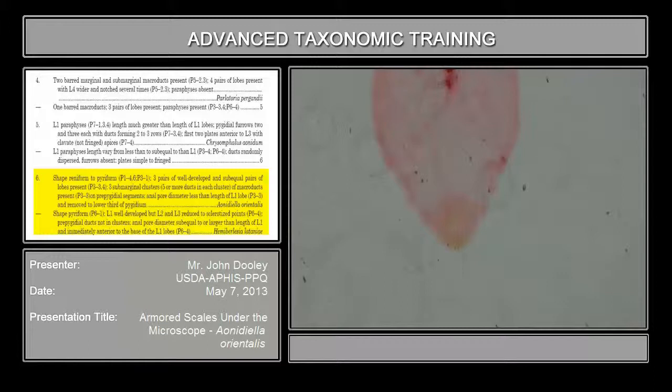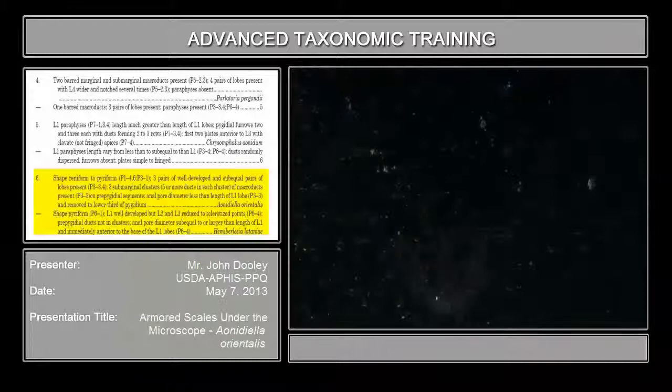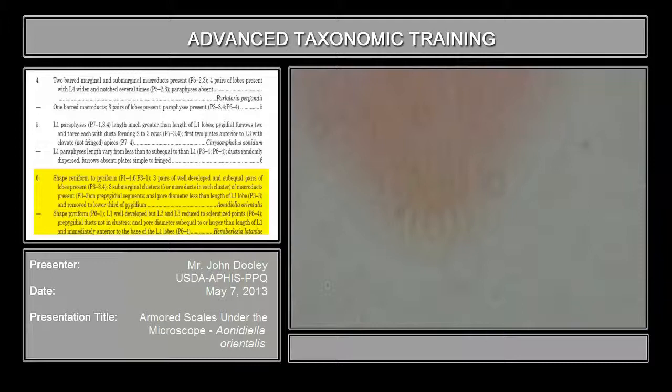If we have time, we'll take a look at arancii. I don't know if I have that or not. But anyway, this is also important. If you look at it, the shape is reniform to pyriform.